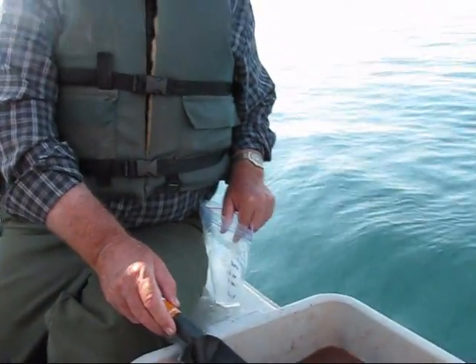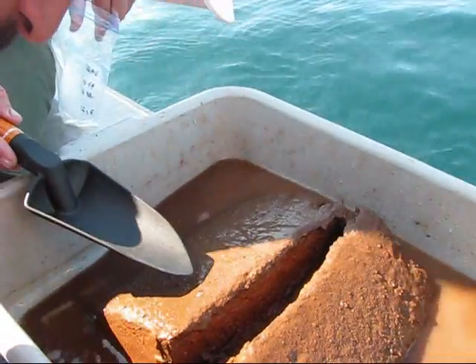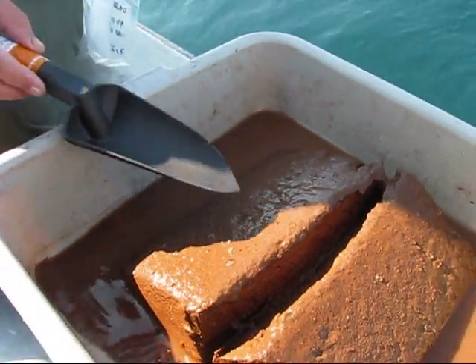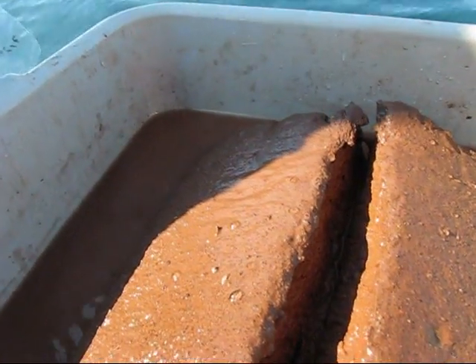Yeah, there's holopedium on here and there's diporeia. That's this one here moving around. Now we will sieve samples and then collect these things. So there's a diporeia. That's a holopedium. Snot balls are the holopedium. The ones that are suffering, amphipods moving around, that's the diporeia.